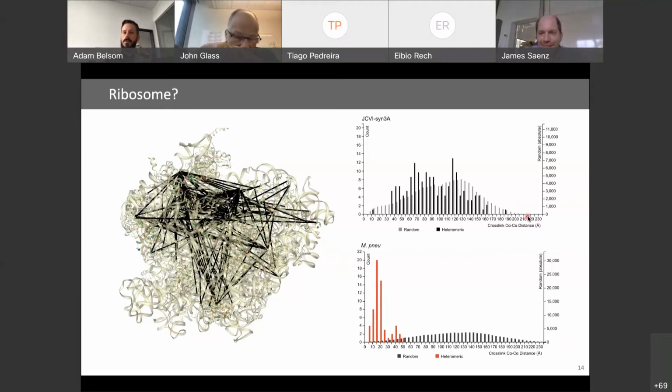And it's possible that we could be capturing noise in the cell just by going deeper, although I don't think that's the case, because we don't see, for example, the ATP synthase, we don't see all the subunits cross-linked together. So I think there is overlap, but we also see some differences too. This is something that I will look at in the future.